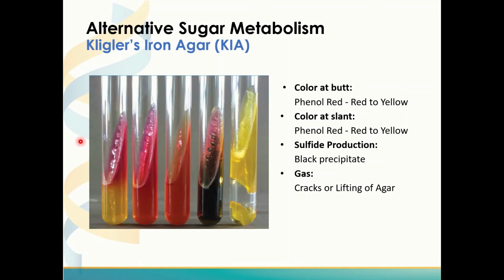The KIA test is designed to differentiate among the different groups of the Enterobacteriaceae. This differentiation is made on the basis of differences in carbohydrate fermentation patterns and hydrogen sulfide production by the various groups of intestinal organisms. In this method, the slant is inoculated by means of a stab and streak procedure. This requires the insertion of a sterile streak needle from the base of the slant into the butt. Upon withdrawal of the needle, the slanted surface of the medium is streaked, and following incubation, you will determine the fermentative activities of the organisms.